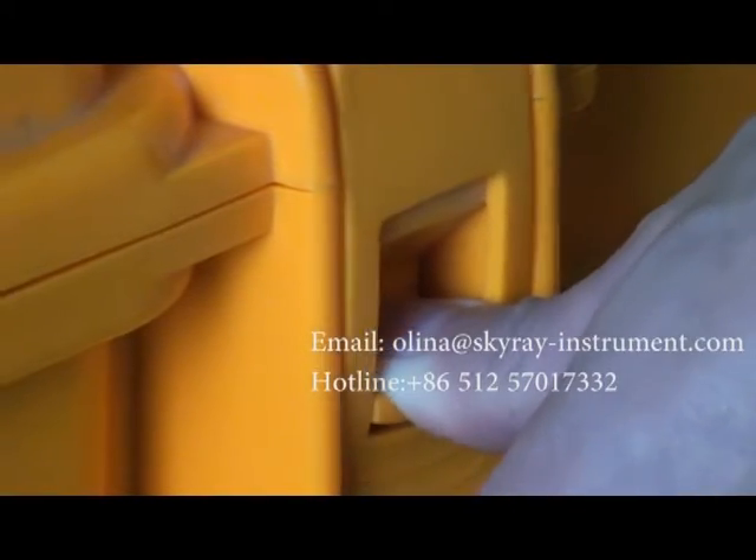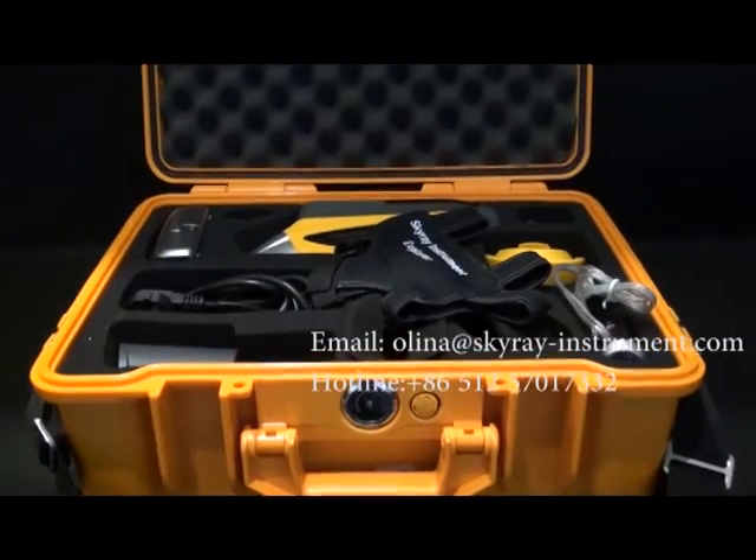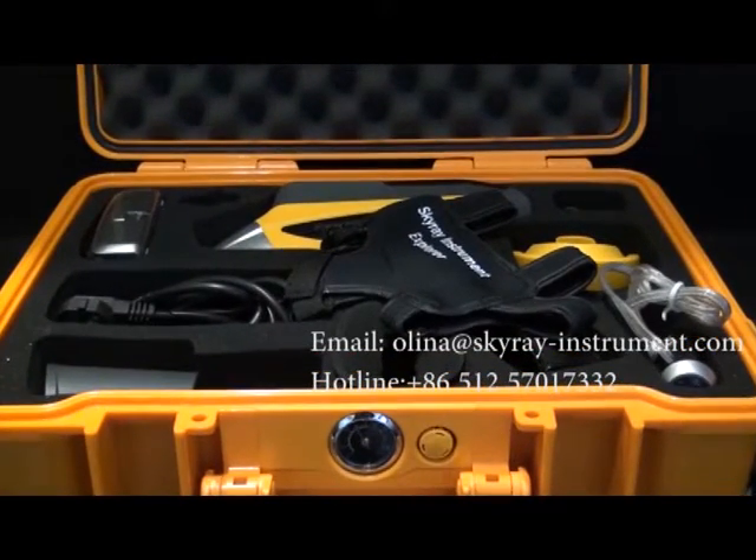First, open the instrument box and check whether the relevant items therein are complete. Items available in this box include the following.